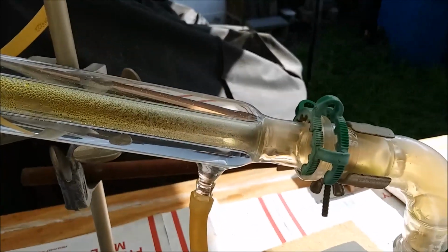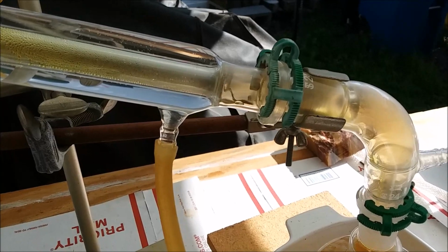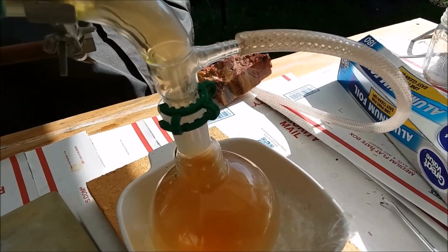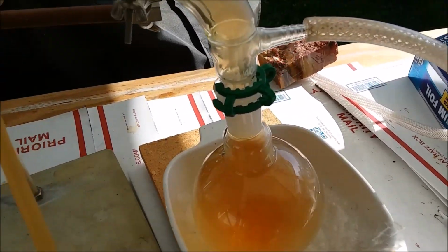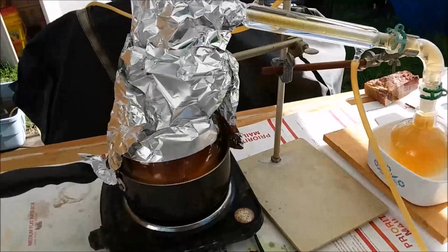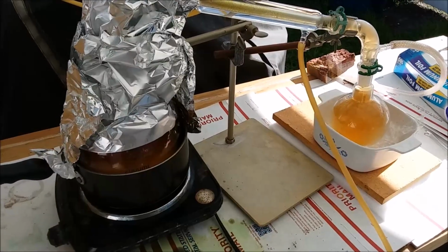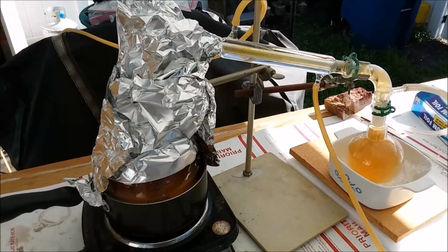And that keck clip's leaking a little bit of gas around it, but most of the nitrogen dioxide gas is being conducted far, far away from me, so it's not bothering me while I paint the inside of my fume hood, which is coming along nicely. I should probably have that done well before this reaction is completed. So things are working good.